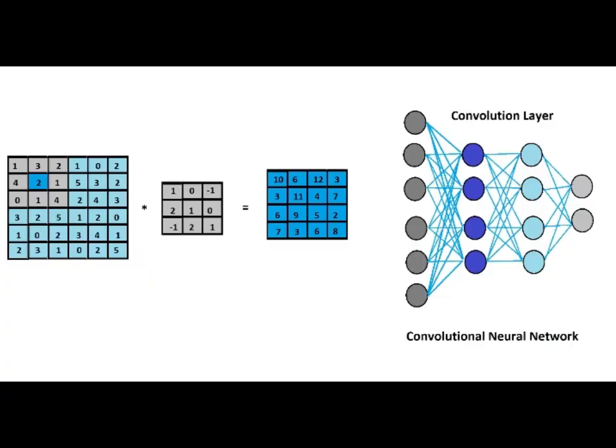For this project, I'm using a convolutional neural network. Essentially, it's a neural network that has a convolutional layer where it will convolve a matrix that could represent a set of pixels with a filter, and that filter scrolls through all pixels. And basically, convolution is good for predicted patterns, and that's very useful for object detection.